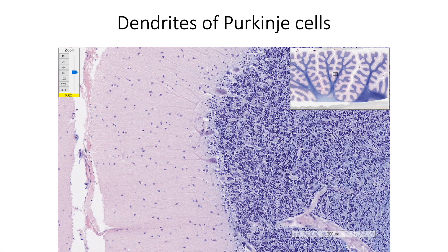Here we can see the flattened dendritic tree of the Purkinje cells in the molecular layer. The proximal branches are smooth and they synapse with climbing fibers, whereas distal smaller branches have numerous spines on their surface and they synapse with parallel fibers.